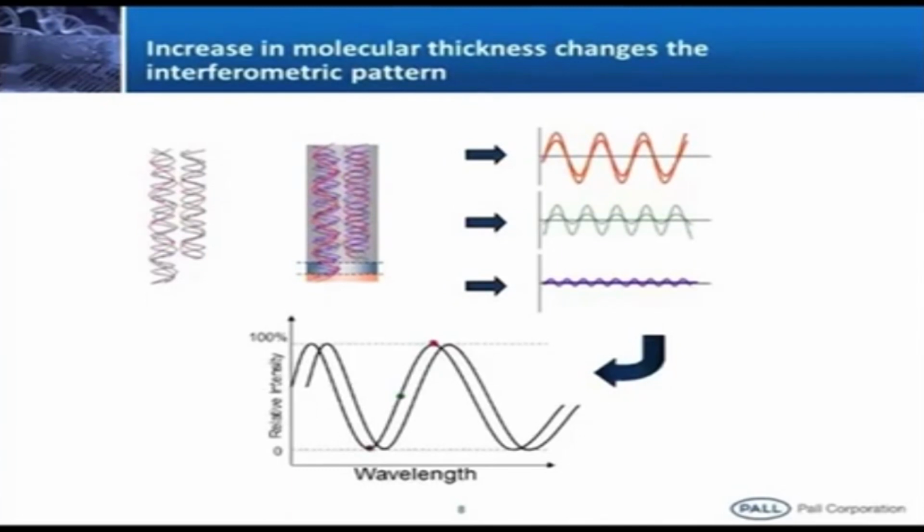Due to this, you can see there is a shift in the spectrum. The path length increases, right. That path length is also dependent on the concentration. The more the concentration, the more molecules bind, and your optical thickness increases. If there are fewer molecules, then the shift will be less. Due to the interaction, we can see there is a shift in the waves. Can you see these patterns? This is due to the interactions.